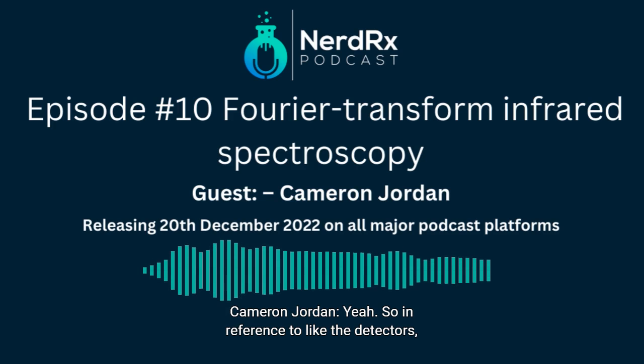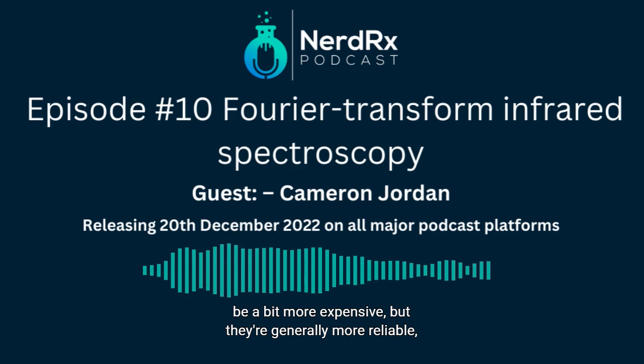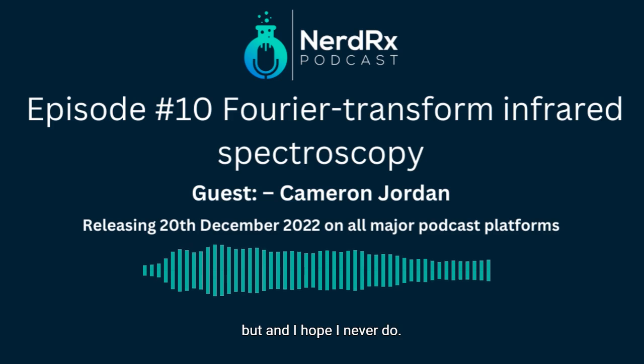Yeah. So, in reference to the detectors, like you mentioned, it depends on the crystal that you're trying to use as well. The diamond ones can be a bit more expensive, but they're generally more reliable and less prone to breaking. For example, there's zinc selenide crystals that are very easy to break. I haven't done it yet, and I hope I never do.